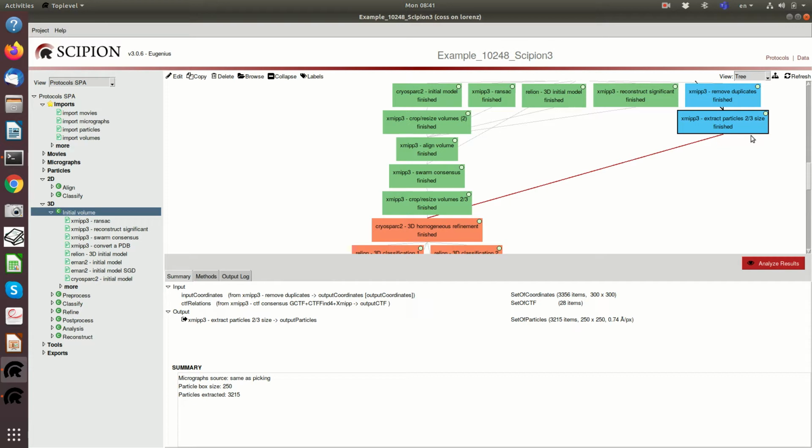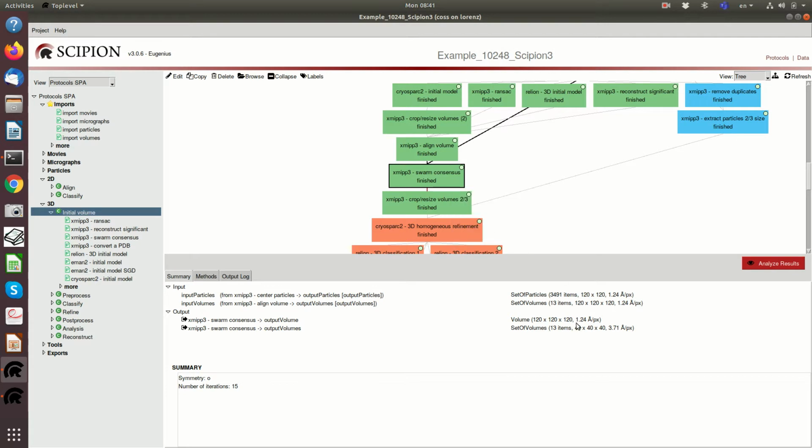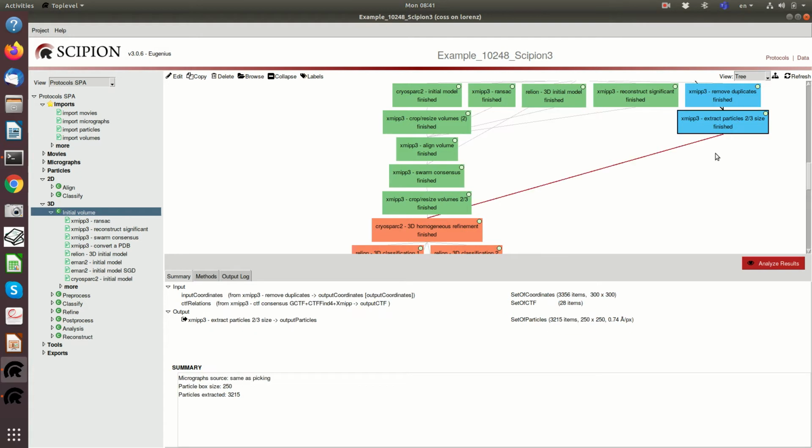It is not that we don't care, but that we cannot really achieve such a high resolution, so all these very little details cannot be correctly compensated.